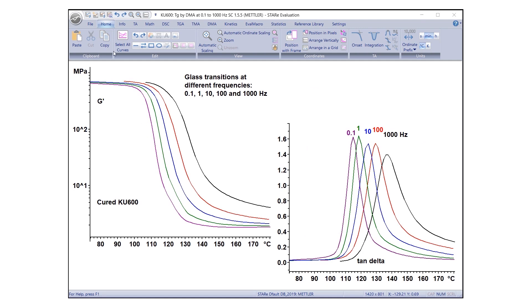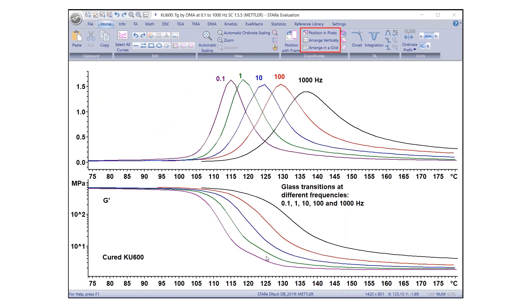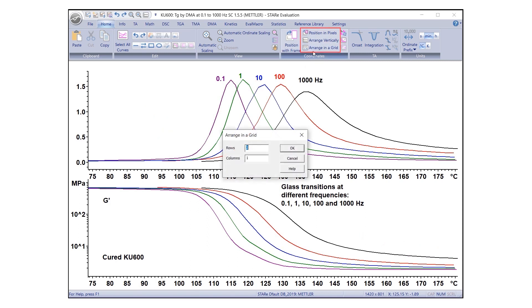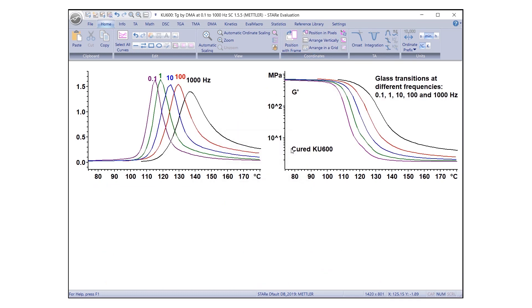To display the curves vertically, click Arrange Vertically. To display in a grid, click Arrange in Grid. A dialog box will appear where you can define the number of rows and columns. After clicking OK, the evaluations will be arranged accordingly.